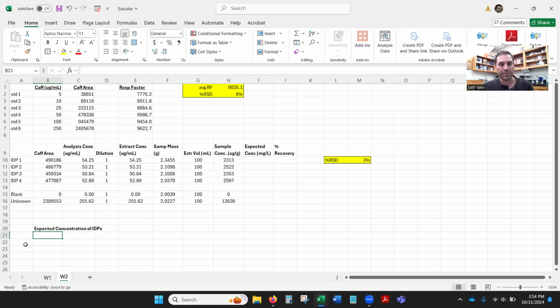So basically, let's remember, as always, what we did. We took 0.5 milliliters of our 10,000 parts per million standard, and let's go ahead and call that micrograms per milliliter, micrograms of caffeine per milliliter of water. And we added that to our sand, right? That's what we did. So the calculation then shouldn't be that complicated.